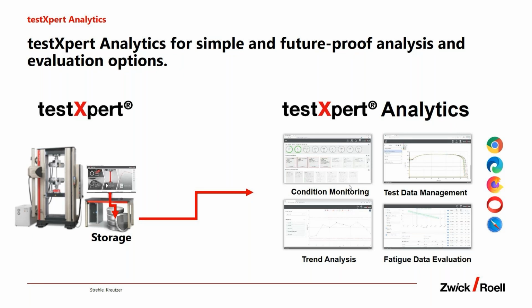But with this storage, we now have the possibility to combine all the data, additionally to these files, in this database. With this database, we have the possibility with these web applications: condition monitoring, test data management, trend analysis, and for very special applications also fatigue data evaluation. You also have the possibility to look at your test data or machine data around the world via the web client in your company network.